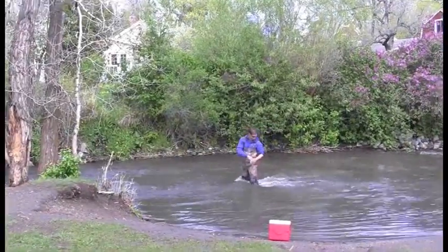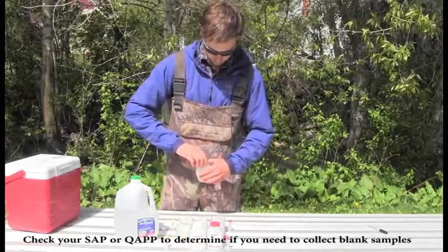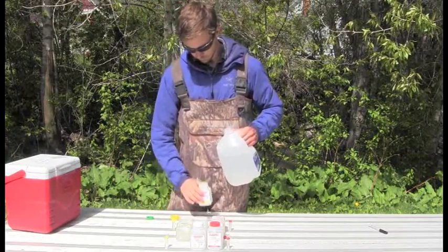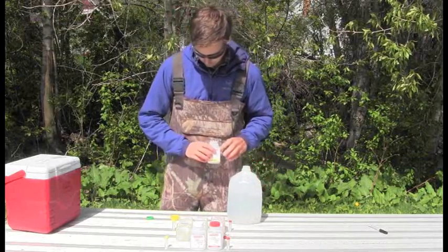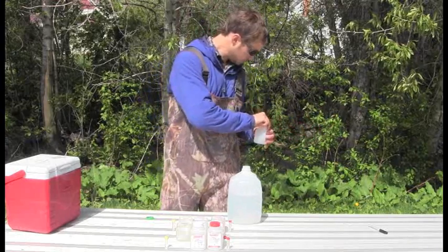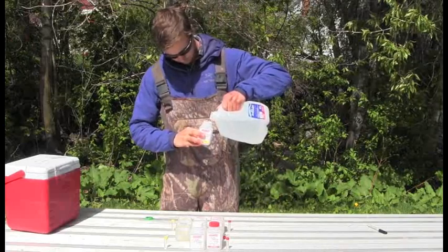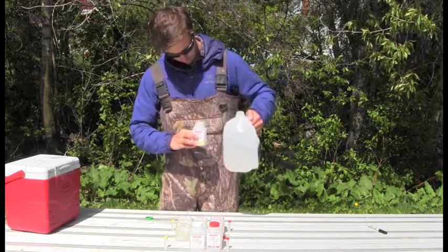You should fill water to the shoulder of the bottle to leave room for preservatives. If you need to collect blank samples, collect these in the field with your other samples, but use deionized water that has been provided by the lab. However, some protocols may allow you to use deionized water purchased through a grocery store like we are using here. Just like the other samples we have collected, remember to triple rinse each bottle with a little bit of DI water before filling it.